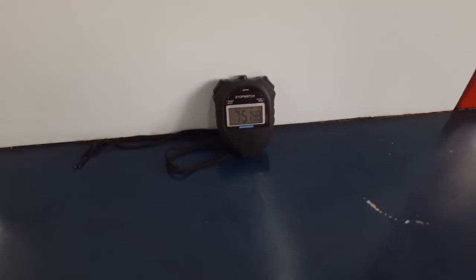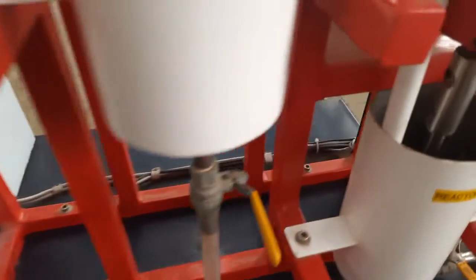It may take another 5 minutes. It just took around 7 minutes. You can see 2 tanks got filled.